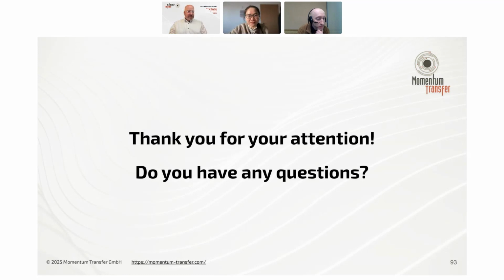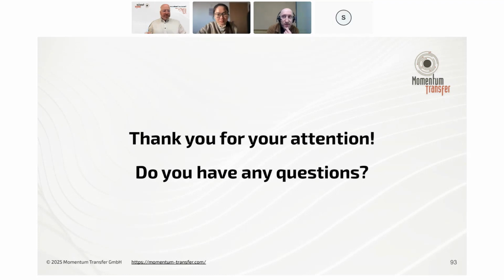Oh, you mean like electron diffraction PDF? Yeah, I think you will not get as good resolution with the electron PDF because actually just doing the processing for it is much trickier. I think there's still a lot of work going into making PDF from electron diffraction more quantitatively accurate. But I know that the benefit of that technique, obviously, is that you can do spatial mapping at a very fine distance.